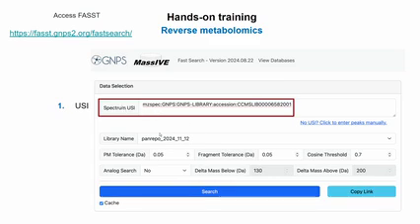If your compound of interest doesn't have any USI, there's this indication here, right, to click to enter the peak manually. The reason why we prefer USI is everything is faster, and the precursor information is already embedded there, the charge state and everything. But if you don't have the USI, you can also generate one by depositing your data into MassIVE, and it will automatically create one. We have very well-defined documentation on GNPS on how you can upload your data to create the USI. We're not showcasing that today because it's already a lot of information to process, but it's possible to do both ways. So either you enter this manually as a 2-column list with the m/z value and the intensity, or you use the USI here.